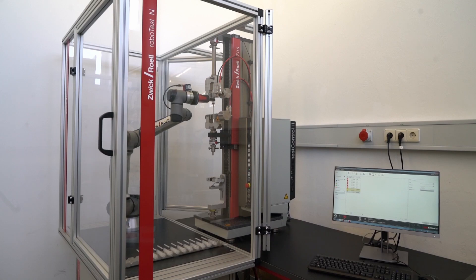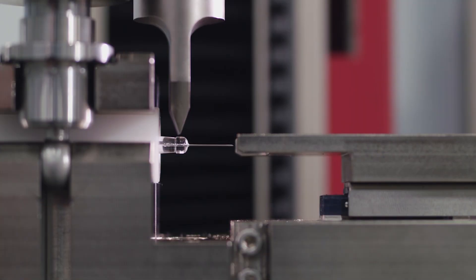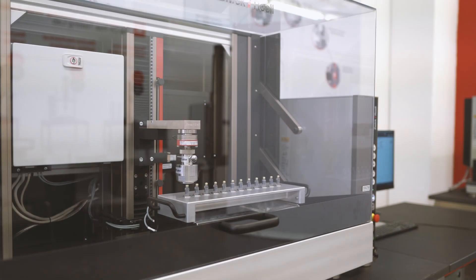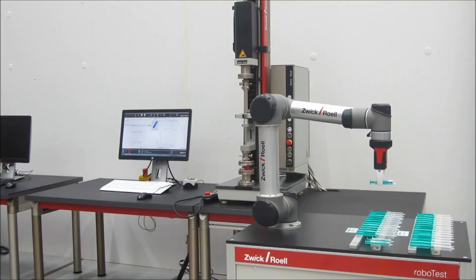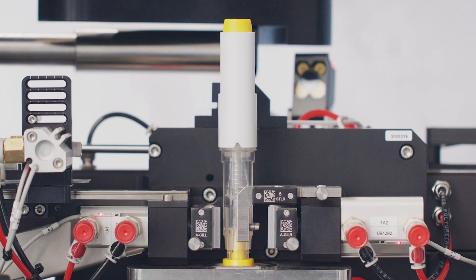Our customers are increasing their production on syringes, needles, and especially vials to be used for vaccination, and our testing guarantees reliable test results for this high number of products.